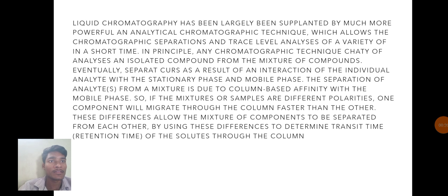largely been supplanted by a much more powerful analytical chromatographic technique which allows chromatographic separations and trace level analysis of a variety of compounds in a short time. In principle, any chromatographic technique analyzes an isolated compound from a mixture of compounds, which eventually separate as a result of an interaction of the individual analyte with the stationary phase and mobile phase.